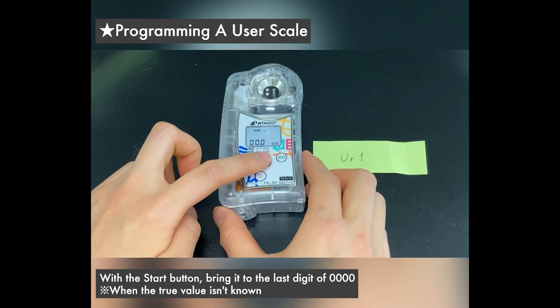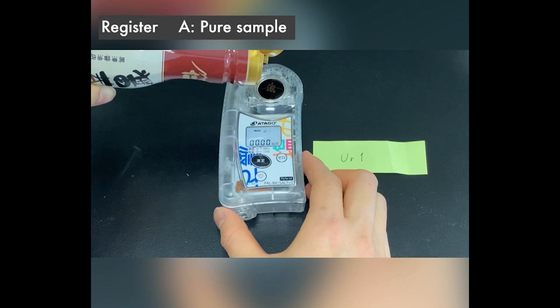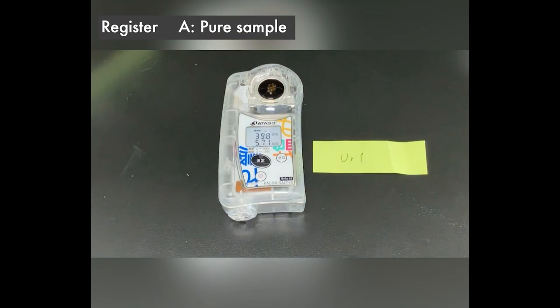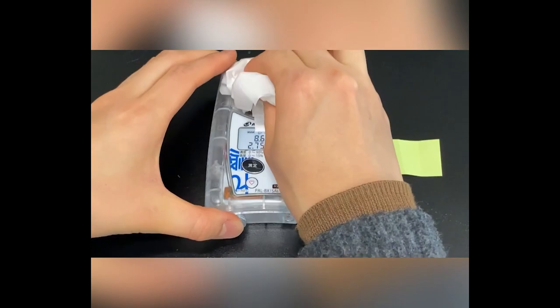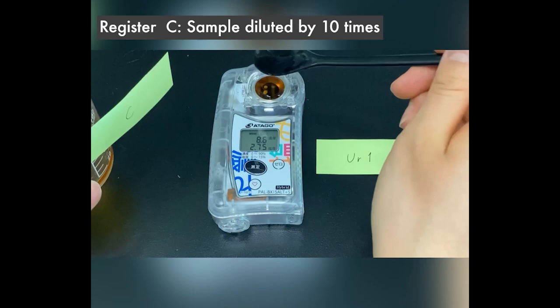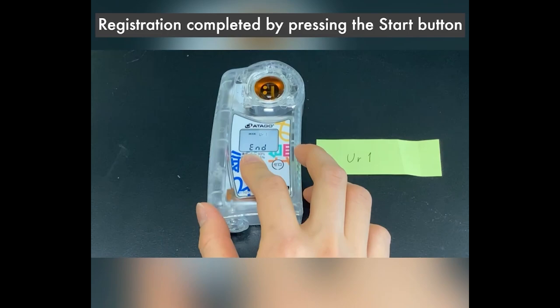Hold the start button and heart button until you see all zeros. Tap the start button to get past those zeros. First, test it with the pure sauce. As you can see, the very high brix means the salt reading will be wrong — let's fix that. Test it with your five-times-diluted sample and hit the start button. Put in your ten-times-diluted sample and hit start. Hit start one last time. You've now entered a special user scale for this sample.